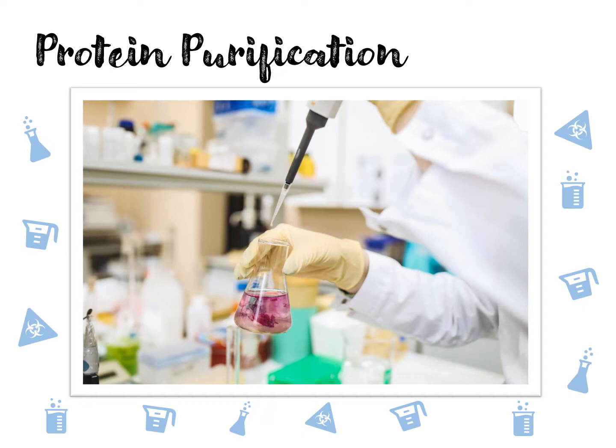That is, once you have broken open the cell and released your protein of interest, how do you then clarify the lysate, that is, free it from cellular debris, genomic DNA and other contaminating agents that would interfere with further steps of purification? And how do you prepare the final load which you're going to apply onto your different beads for protein purification?